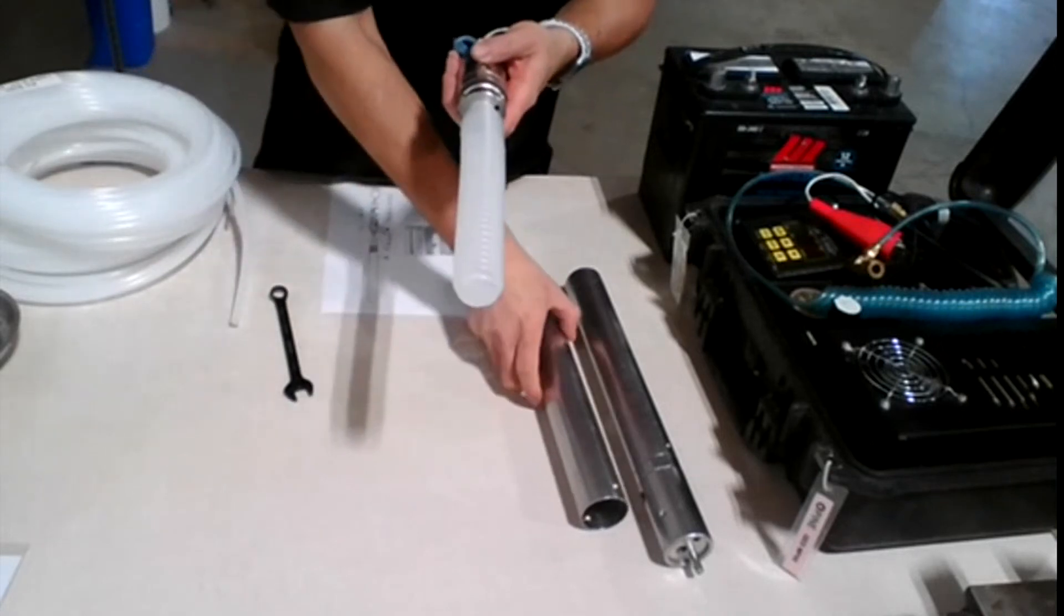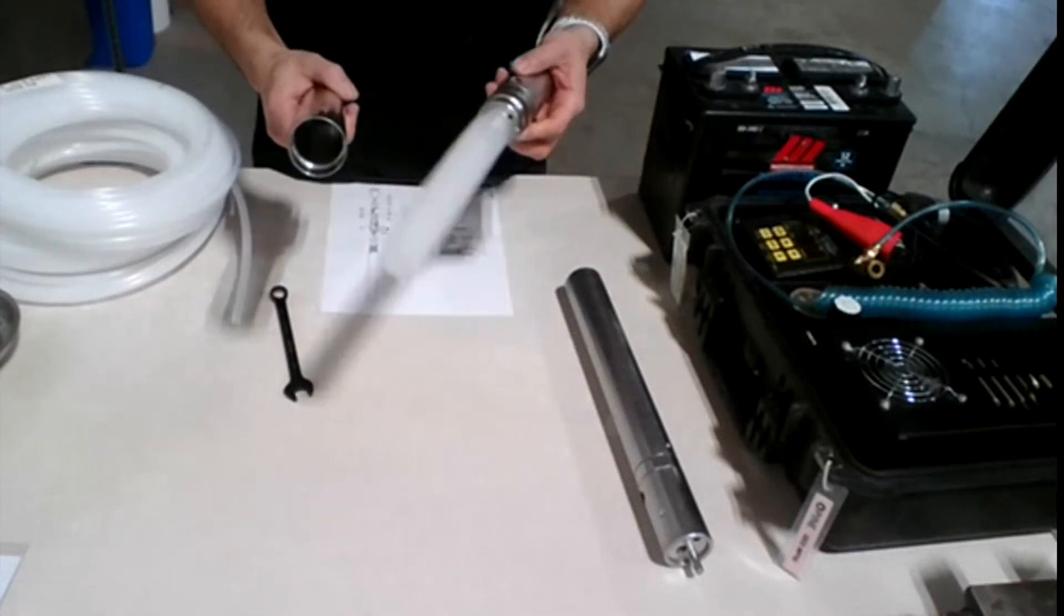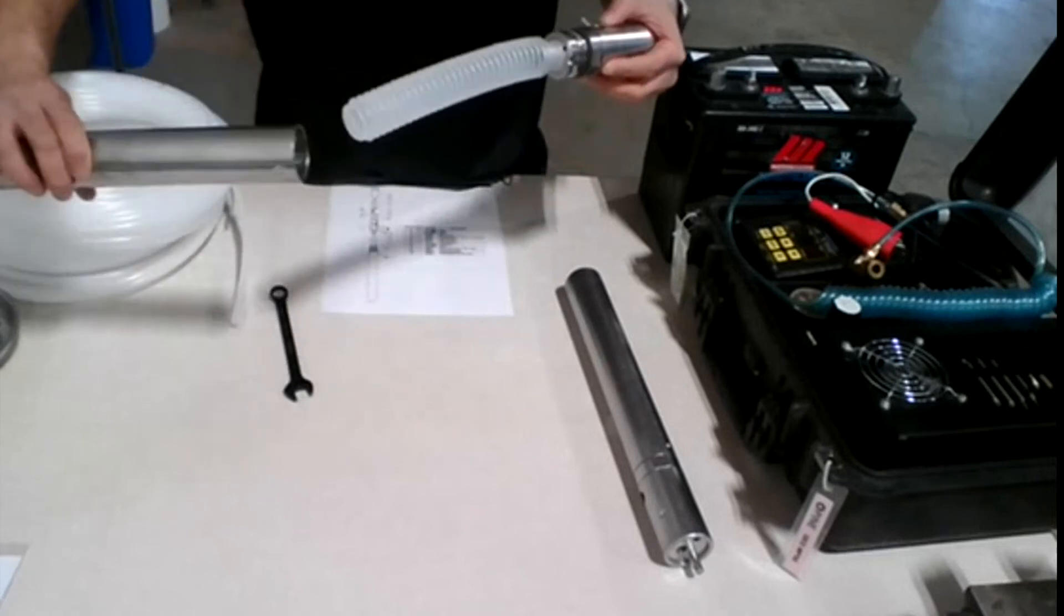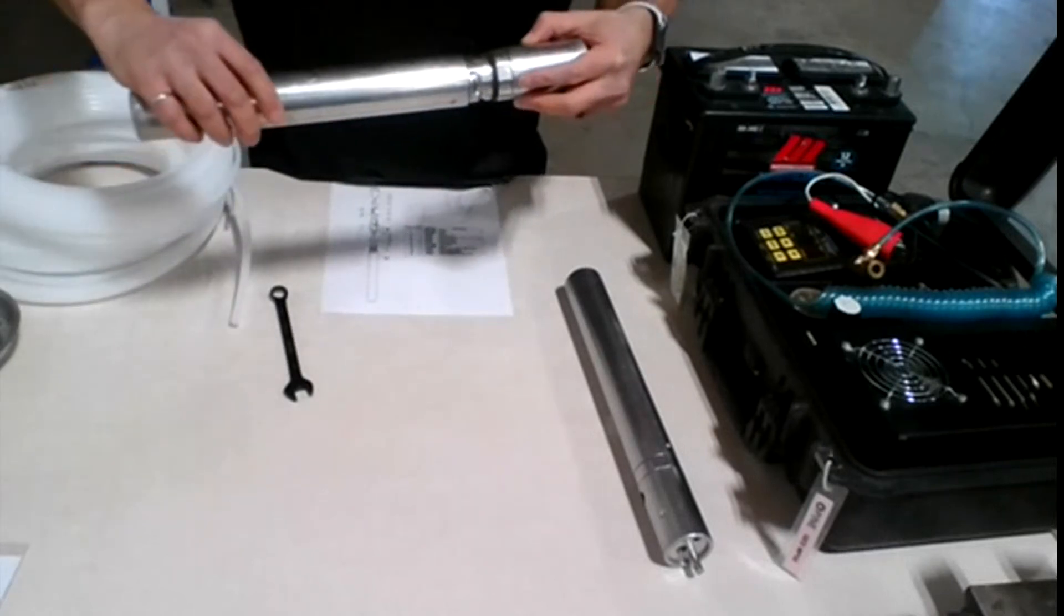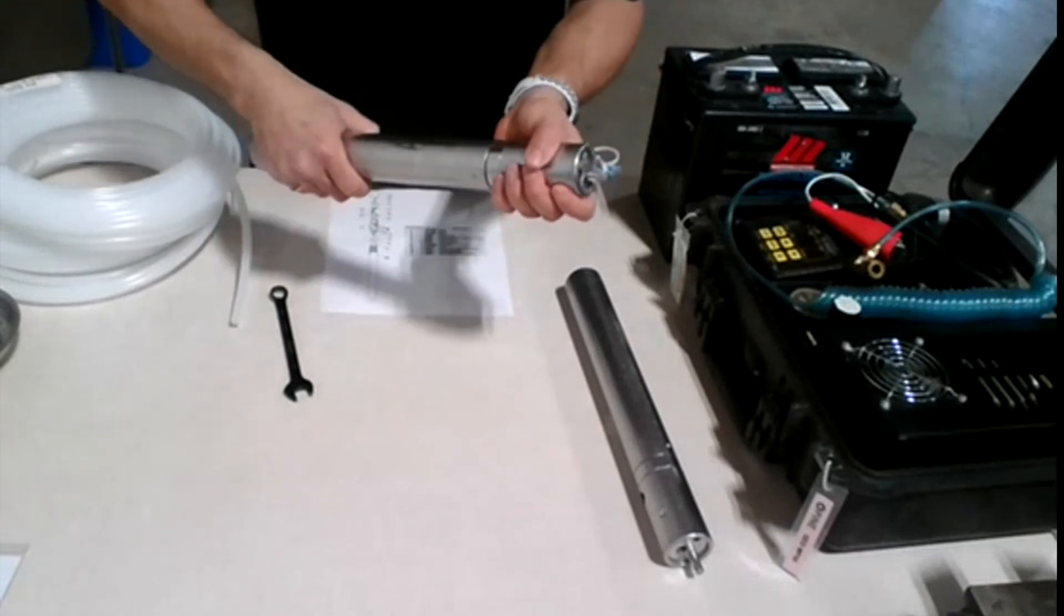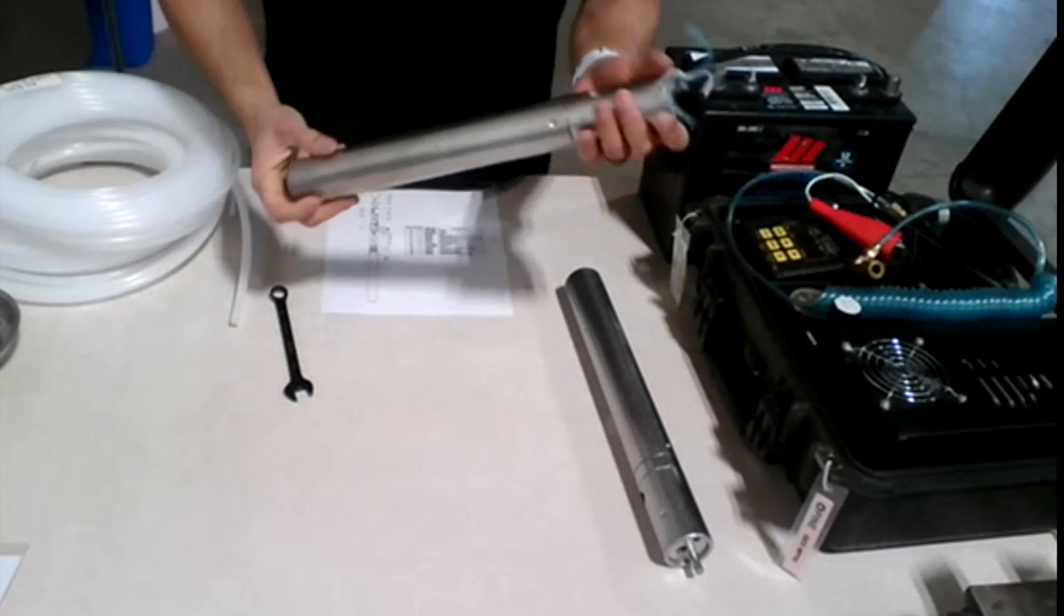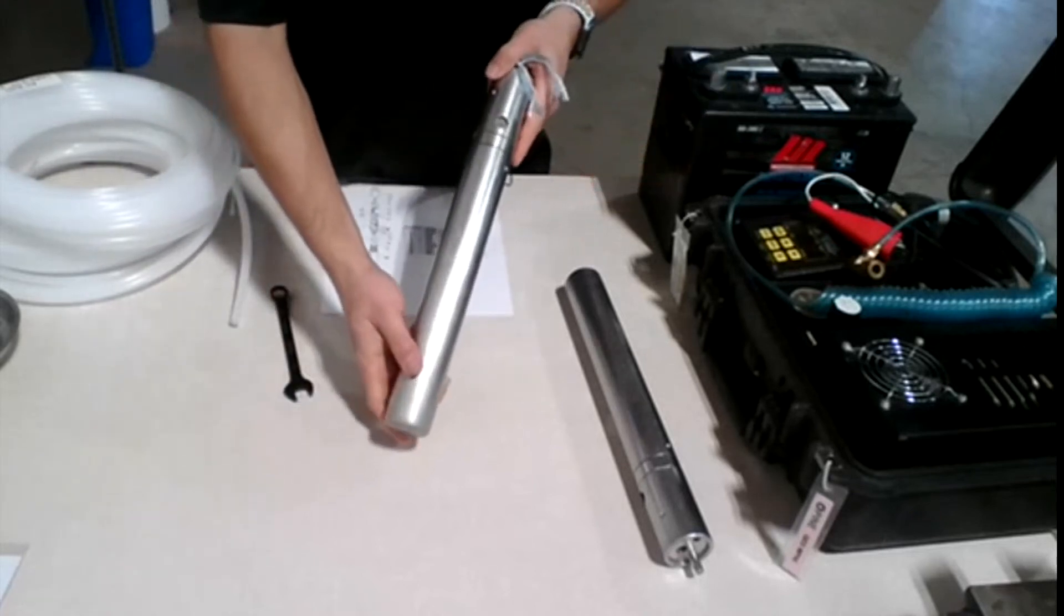Final step would be sliding the casing into the pump itself to seal it. Just screw it in like that. Give it a good screw. Make sure it doesn't move anywhere. And now your pump is ready to go.